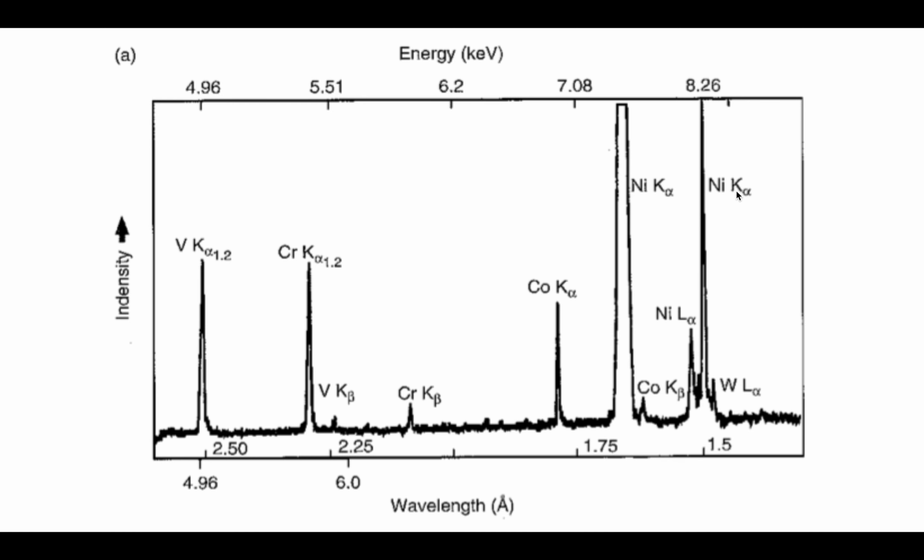If you're asking yourself how this can happen, you've got to think back to Bragg's law and remember the n in that equation. That's the order of reflection. Up to this point, we've only looked at first order reflections. Well, this is showing us that we have multiple orders of diffraction.